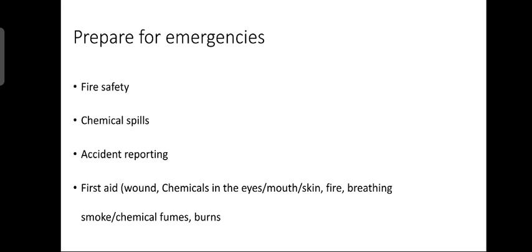If there are injured victims, provide the minimum necessary first aid only if you are sure that there is no danger to yourself. If providing assistance will endanger you, do not attempt intervention and move the victim immediately to the nearest hospital. In the case of emergency, call an ambulance and then the fire station.